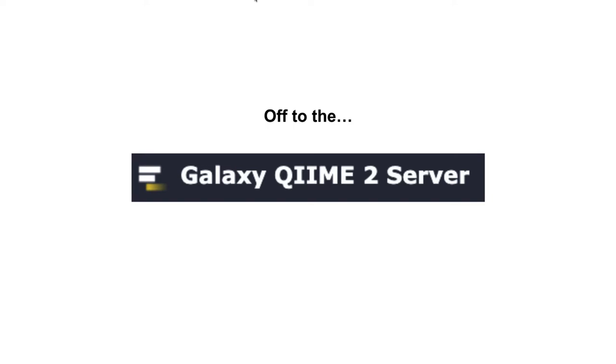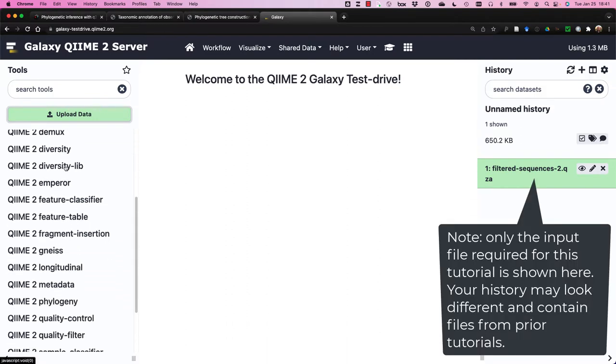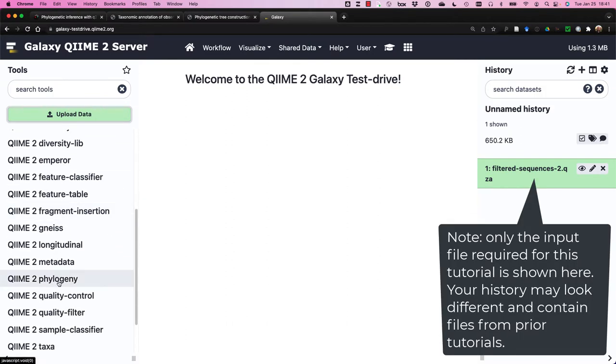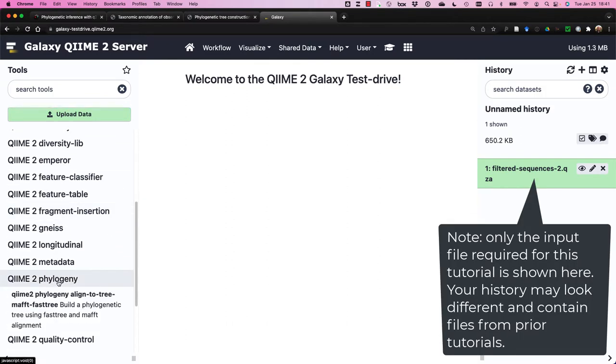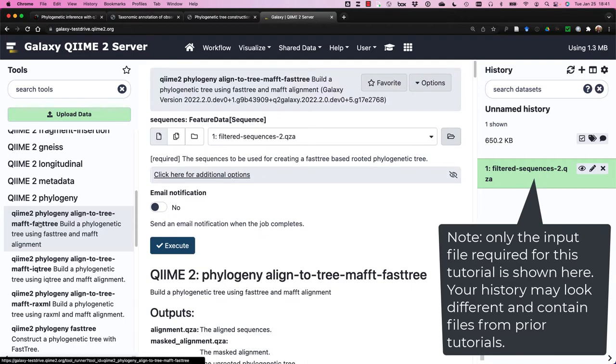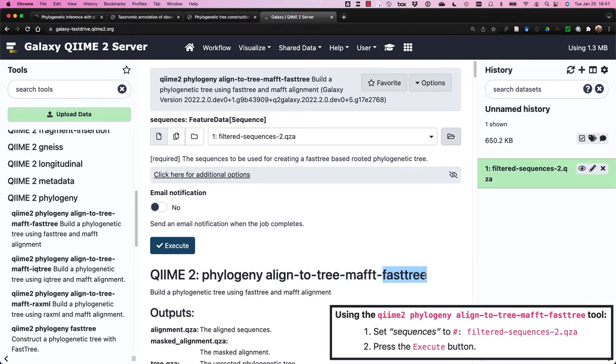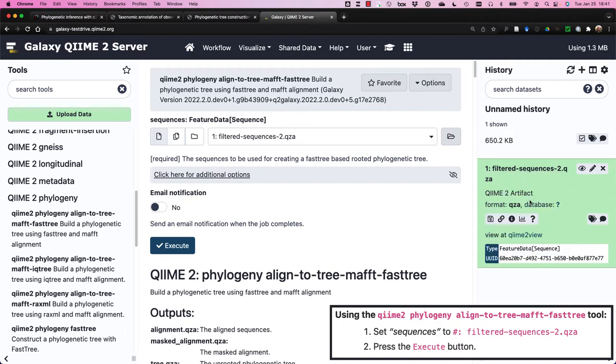Let's run the QIIME phylogeny plugin using the Galaxy interface. And what we'll do is we'll skip down to the phylogeny plugin, and we are going to make use of the pipeline AlignToTreeMafftFastTree. Again, even though it is a long name, it's telling you that it's going to produce an alignment and return a tree. And it's going to do this by building an alignment using MAFFT, and the tree will be produced using FastTree. Our file is already here, as expected. We can make sure we can look at the type, it's feature data sequence.